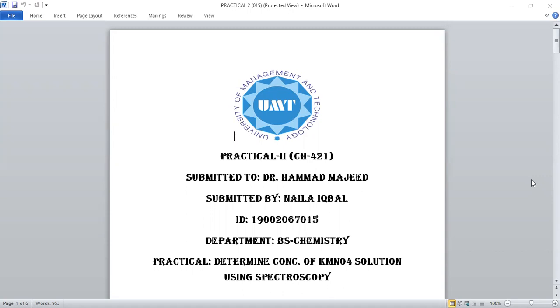I am from the BS Chemistry Department, and the topic of my practical is to determine the concentration of KMnO4 solution using spectroscopy.